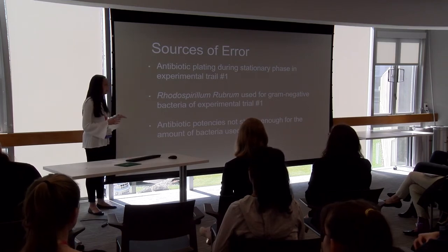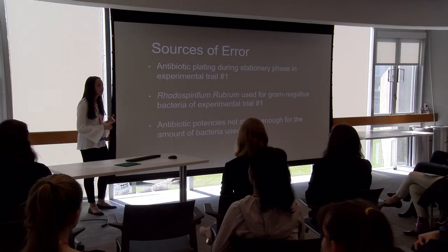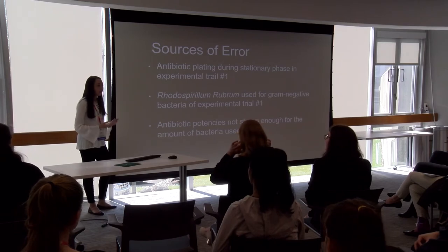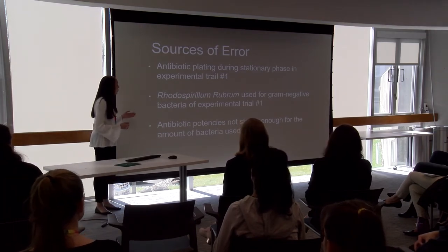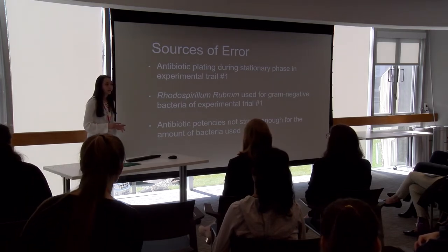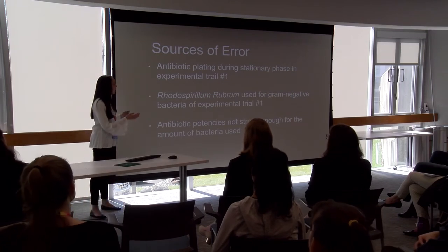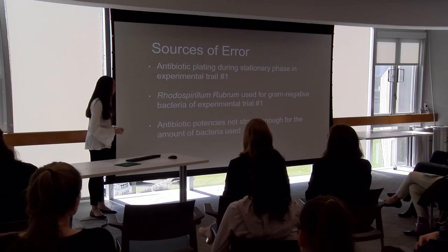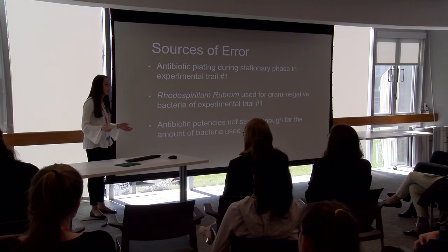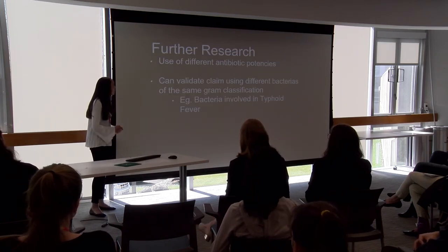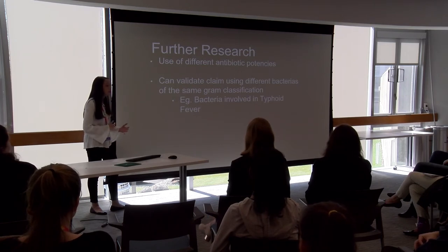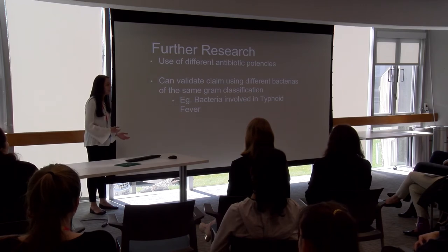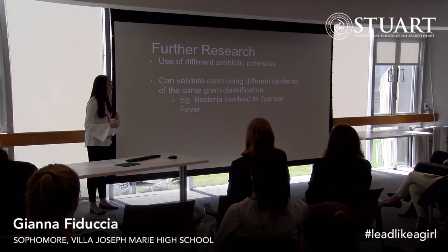For sources of error: before this experiment, I did a pretrial with two problems. First, I plated the antibiotic discs during the stationary phase, and it was inevitable I would get no results because the bacteria was already fully grown and the antibiotics couldn't do anything. Second, I used a bacteria called Rhodospirillum rubrum, which is gram-negative but very slow growing, and I didn't use the right growing conditions, so I switched to E. coli. The antibiotic potencies were also probably not strong enough for the amount of bacteria used. For further research, different antibiotic potencies could be tested to determine if bacteria were truly resistant or if the potency was just too low, and multiple gram-positive bacteria could be used instead of just Bacillus cereus to create a more validated relationship between gram classification and antibiotic susceptibility.